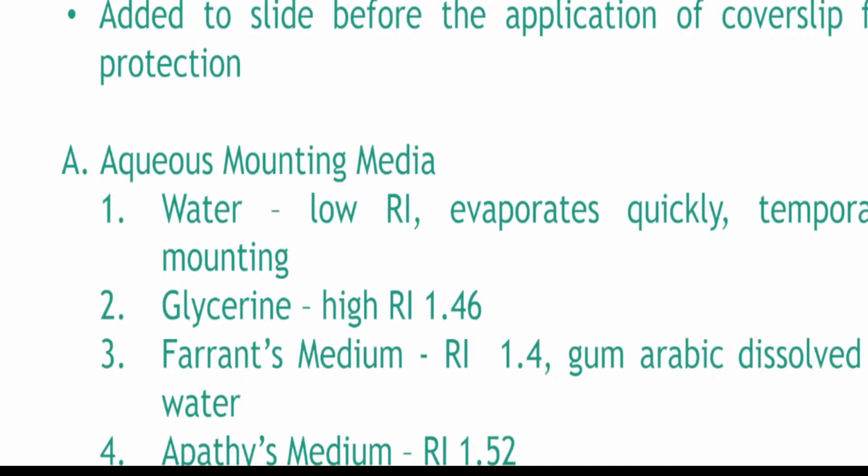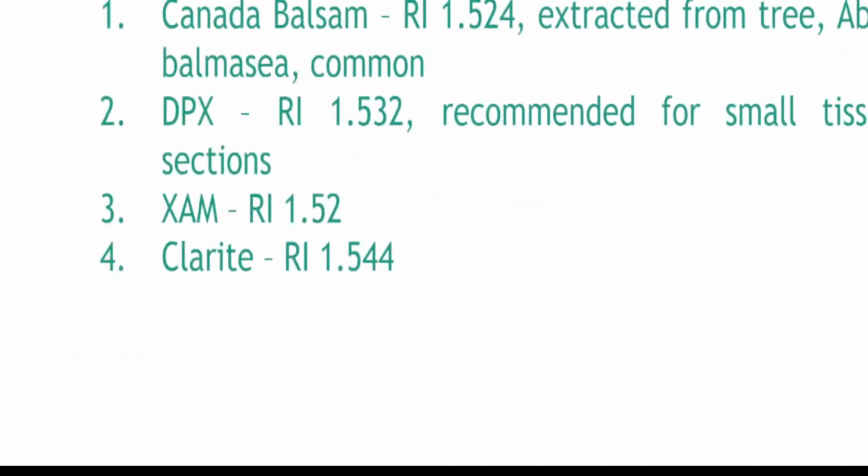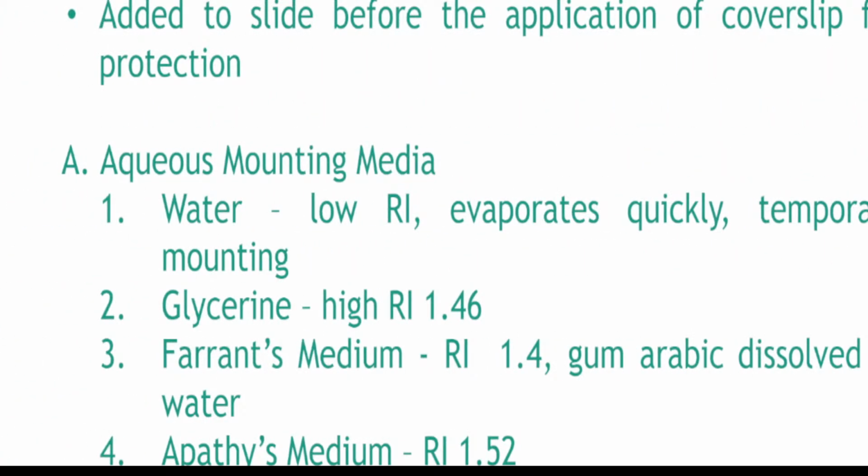Mounting media. This is added to the slide before the application of a cover slip for protection. Okay? So you have aqueous mounting media and you have resinous mounting media. Which do you think is the most important? Which do you think is better? There's no one is better.